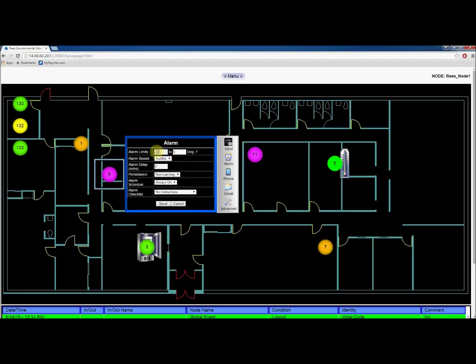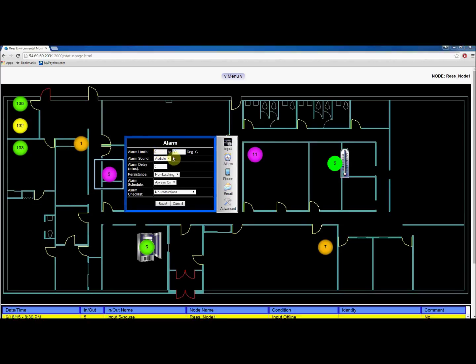Next, click the alarm icon to the right. Enter the alarm range in the top boxes and choose if the alarm will be audible or silent.